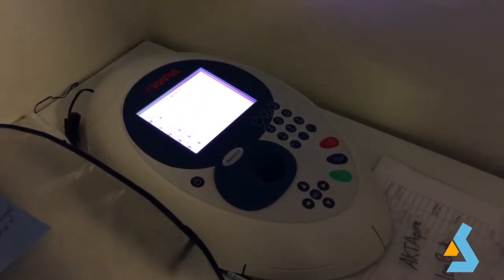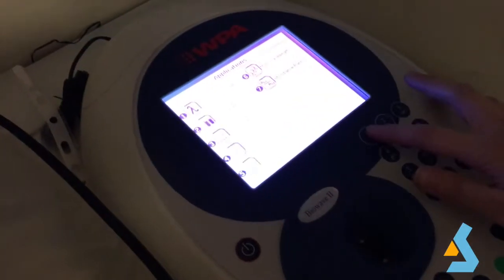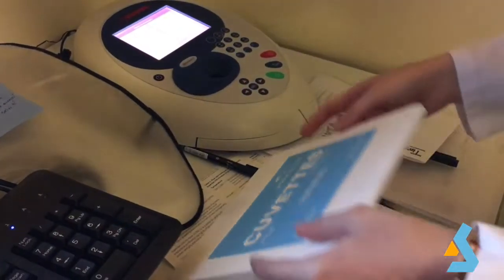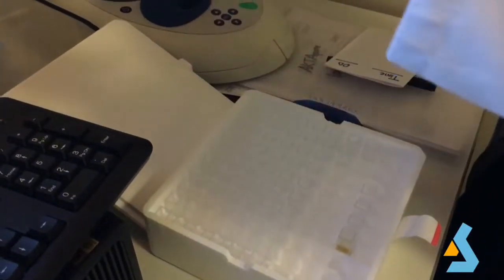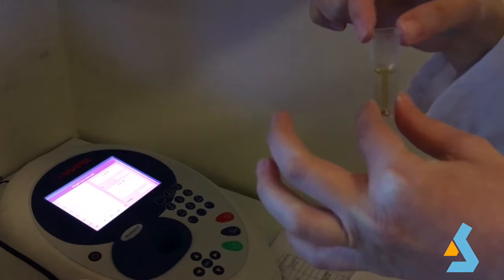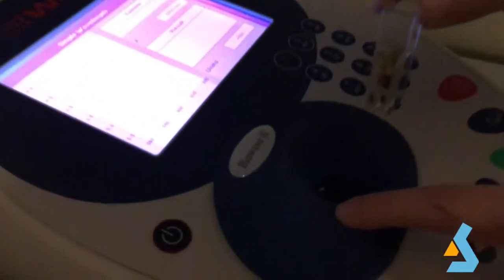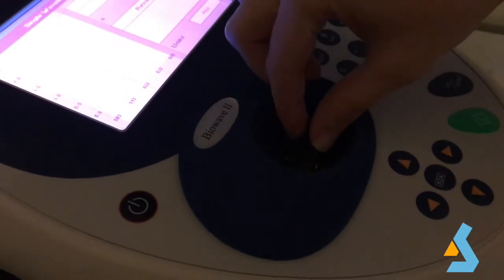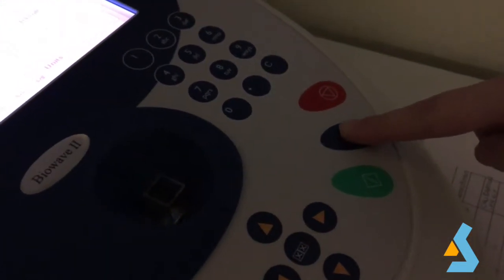In the UV spectrophotometer, we choose applications and single wavelength measurement. We set the wavelength to 600 nanometer and then press OK. First, we place LB kanamycin media as blank. While placing, follow the arrows indicated on both cuvette and sample holder. This is crucial to assure correct placement of cuvette and access to light. Also, do not touch the below part of the cuvette. After placing, press blank and let it measure.